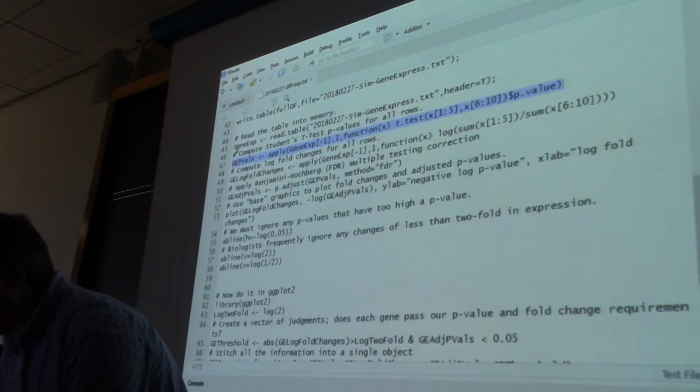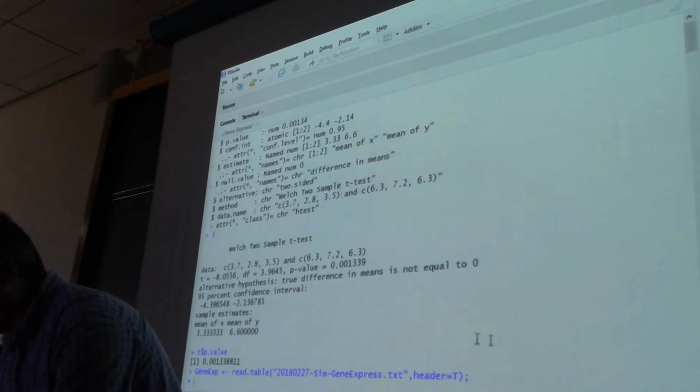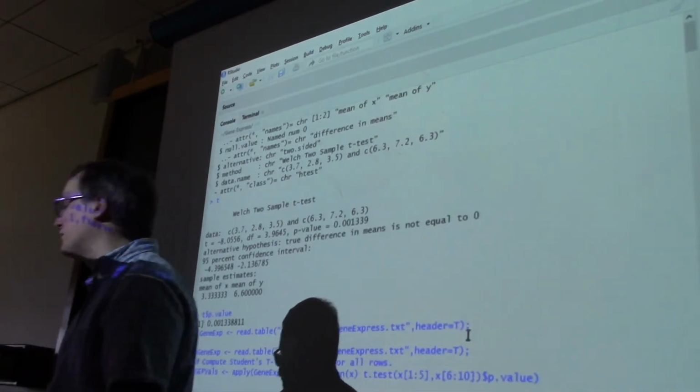I'm going to run everything up to this. So, all right, grab that. Copy that. All right. There we go. Well, it didn't take forever, did it?